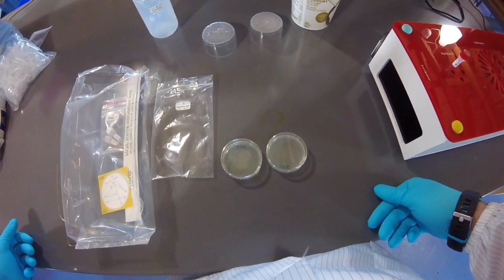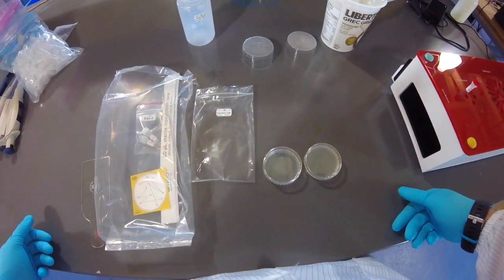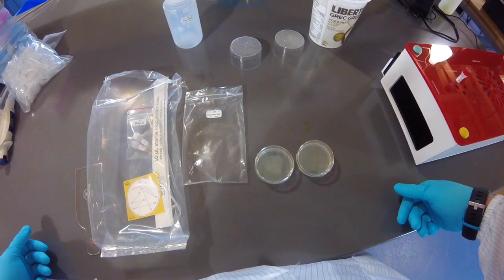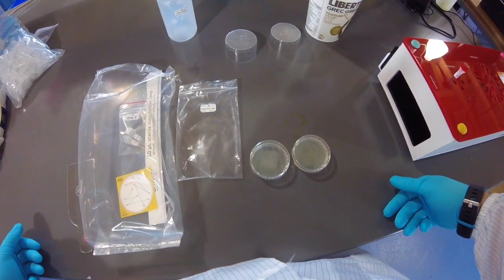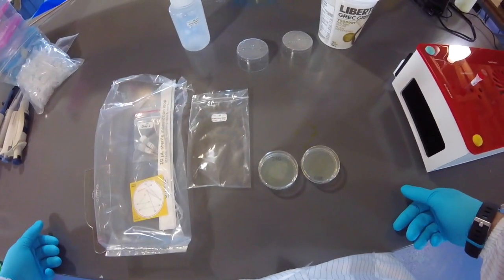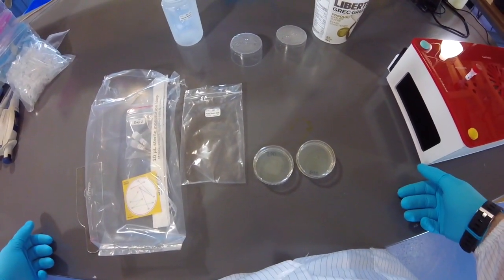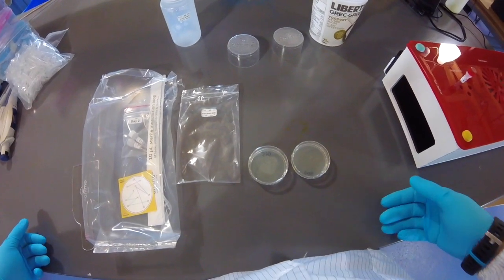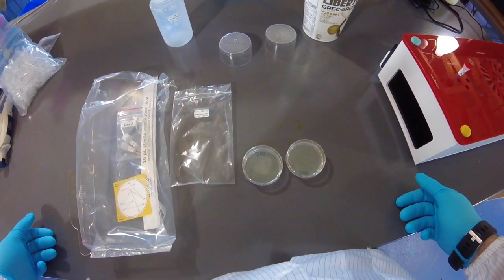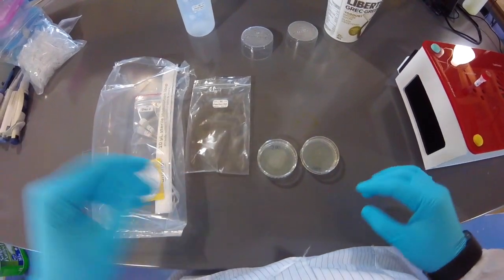And then on day 2, when we came, we saw that there were some nice colonies of blank cells on the non-selective plate. When we looked at the negative control plate, we saw no growth of bacteria at all. And this is expected. This negative result is expected and suggests that our plates were made properly, or at least they have antibiotics in them, because the blank cells don't have any gene in them. They haven't been engineered yet with a gene, so they haven't become resistant to that antibiotic. And so this is all good.